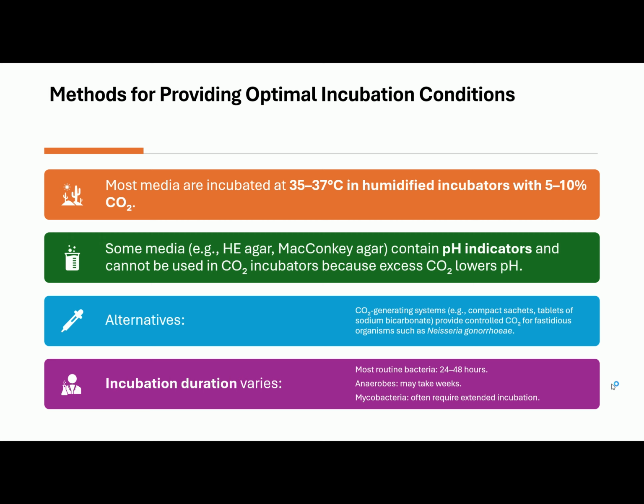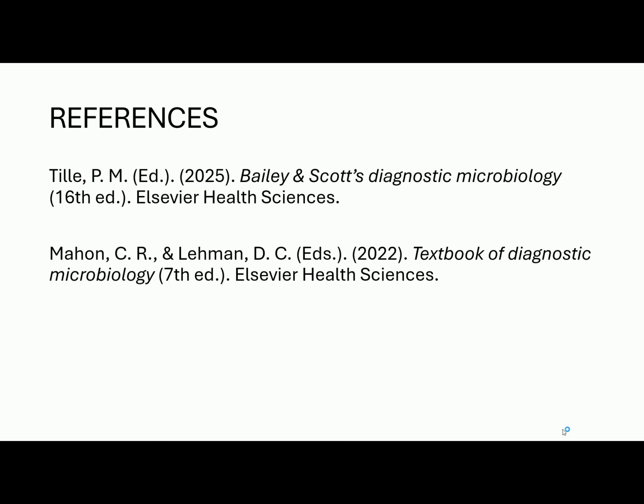Incubation duration varies. Mostly routine bacteria take 24 to 48 hours, 1 to 2 days. Anaerobes may take weeks, while Mycobacteria often require extended incubation. For Mycobacterium, class, usually 8 to 10 weeks. So here are the references. That ends activity 5, media preparation. Thank you.